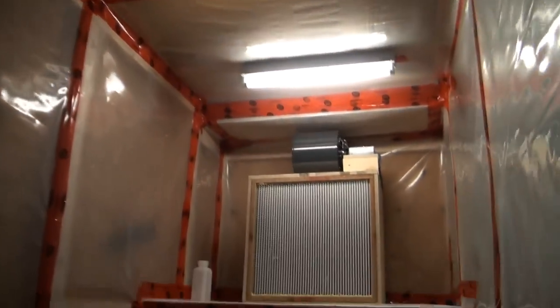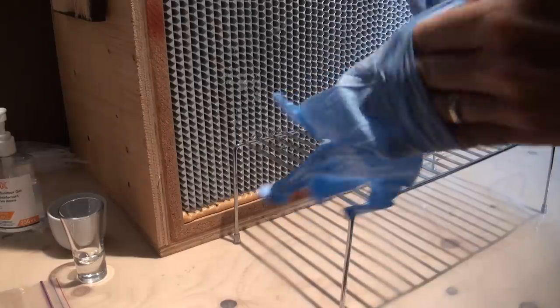Most of the stuff I'm going to talk about today is not 100% necessary. For every piece of equipment there's always a cheaper alternative that will probably work just as well. So don't think you have to run out and get all this equipment right off the bat. Your lab really can be set up anywhere — basements, offices, closets, garages. Pretty much anywhere will work as long as you follow a reasonably good sterile procedure and have a few key pieces of equipment.